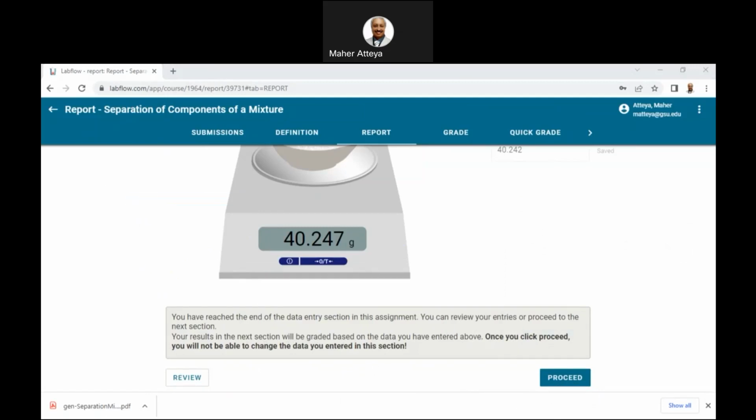Edit, copy. Yeah, we have entered all required data, and we will proceed with the actual calculations.